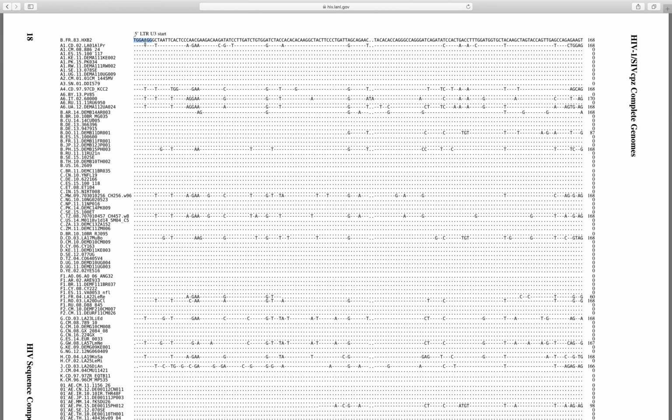What a multi-sequence alignment is, you're taking, and there's the assumption that you have related sequences, or sequences that may have some type of homology, but you're taking multiple sequences and you're asking a computer program to basically say where certain sequences align to other sequences. So the way that this one was made is you are aligning all of these other sequences to the reference sequence for HIV, which is the HXB2. And so it tries to do that in the best way possible.